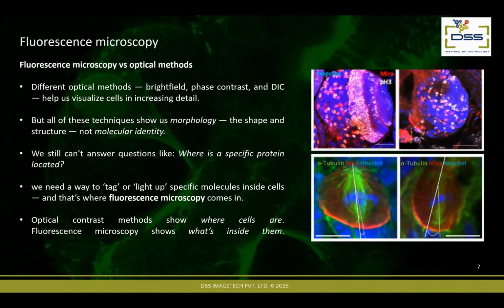Here I'm labeling specific cells inside of a tissue, and here I have an individual cell imaged. In this cell, I can image where a particular protein localizes. I can image, for example, spindle microtubules with an antibody specific to tubulin dimers, and I can visualize the nucleus also. So specific components can be visualized by using dyes or antibodies, and we can get this precise information.